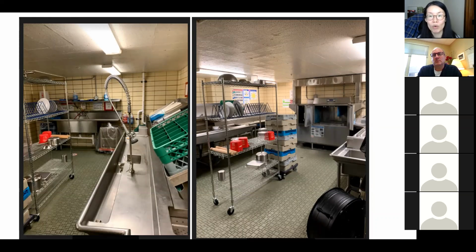Our students are required to pass the ServSafe training when they lead the sensory testing, to make sure that they're complying with all these safety procedures for serving foods.